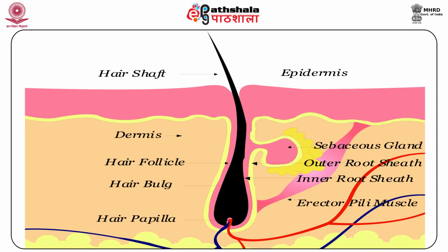they were last cut. When tips are freshly cut, they have sharp cut ends. With the passage of time, the sharp ends gradually become round. The possible nature of the weapon with which the hair has been severed is also revealed. With blunt weapons, the cut end is found frayed and irregular. With sharp-edged instruments, the cut ends have sharp edges. Any deformity or disease in the hair is also noted.